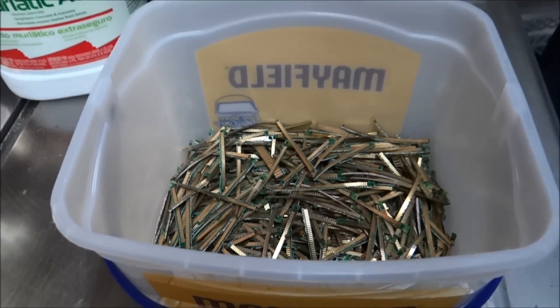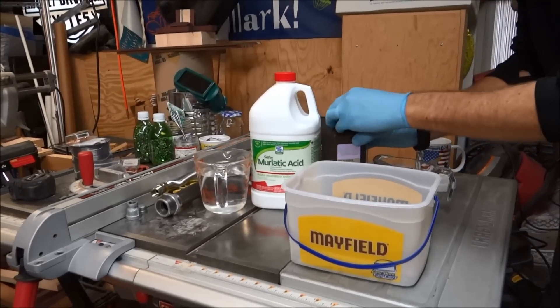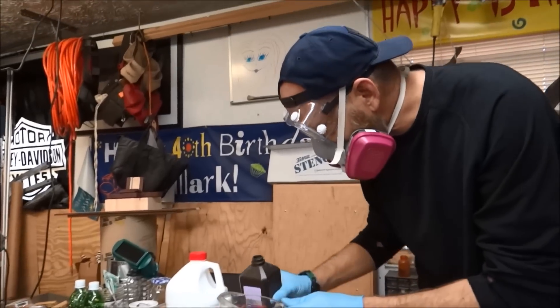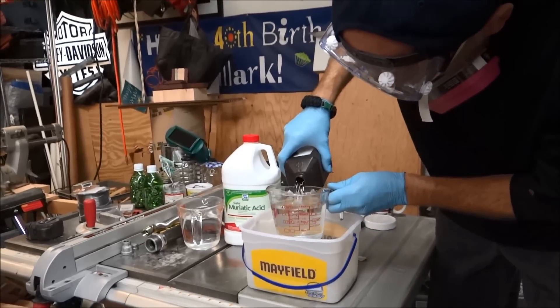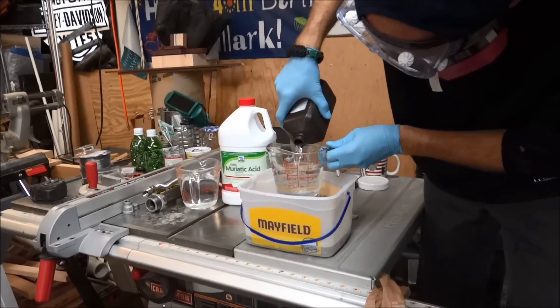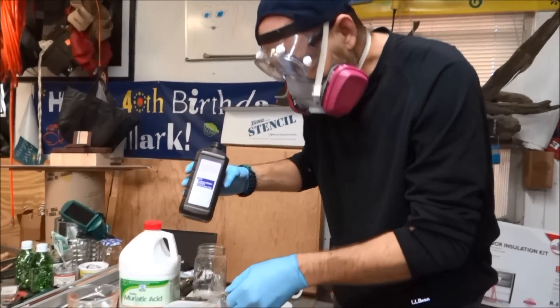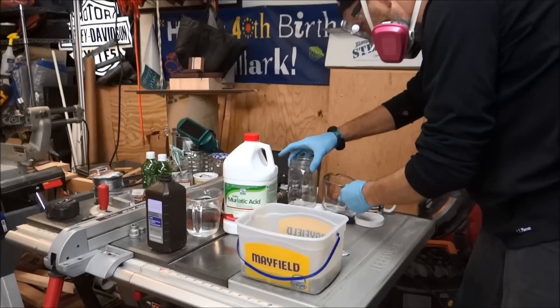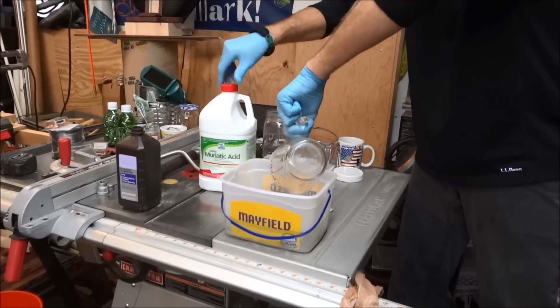Now that we've got all the fingers cut off our memory chips, we put them in a plastic container. In equal parts we're going to add hydrogen peroxide and muriatic acid. Safety first — this is bad stuff. I'm going to start with four cups of hydrogen peroxide. One of these containers equals 32 ounces. There's the hydrogen peroxide. Now we're going to add four cups of muriatic acid.